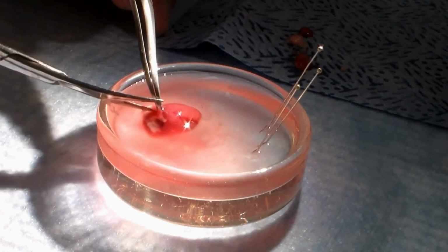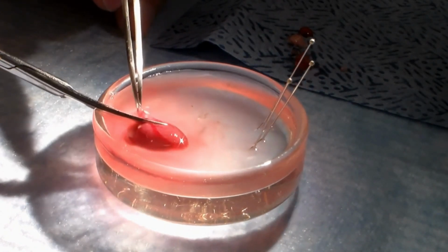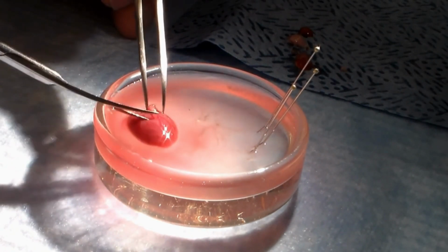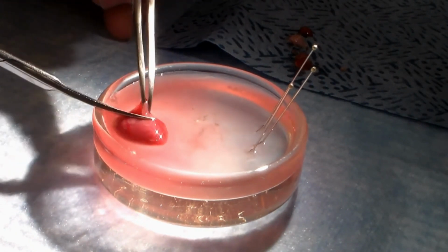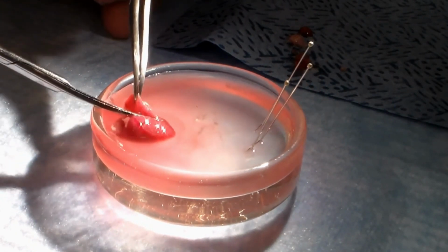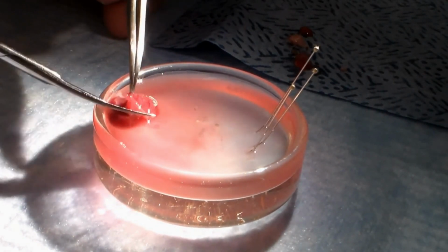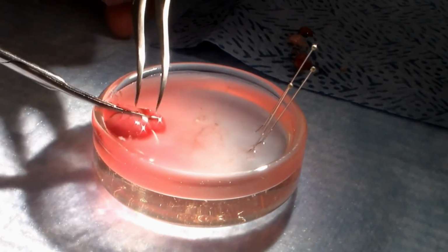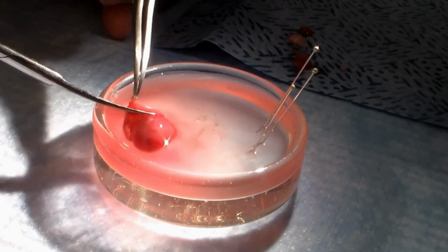So what you're seeing here is that the experimentalist is grabbing the right ventricular free wall with the forceps, and then just cutting away the right ventricular free wall with a small pair of scissors. The idea of cutting away the right ventricular free wall is to expose the septum so that the septum can be obviously visualized.